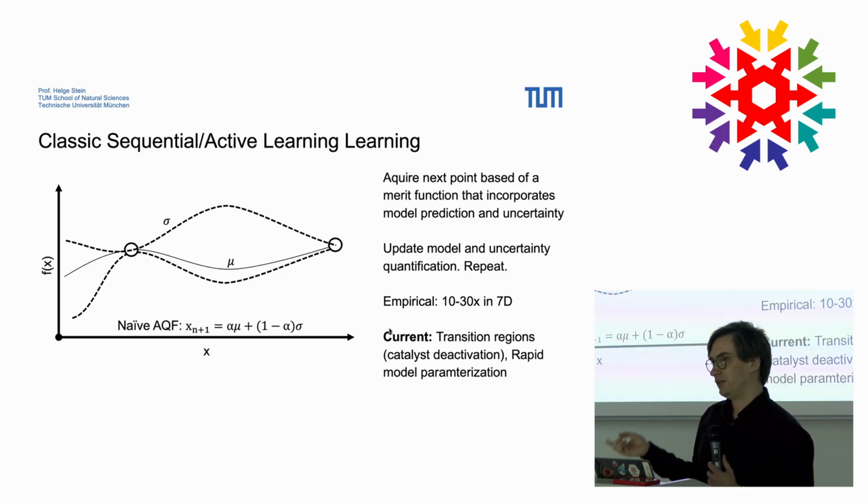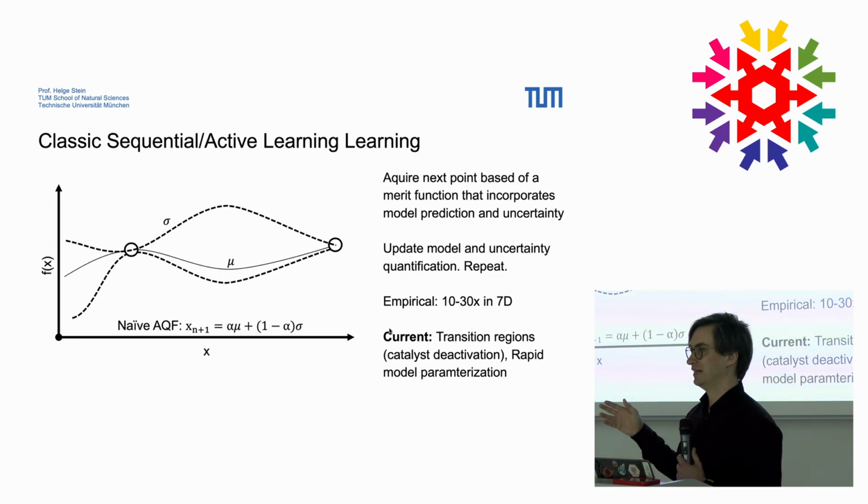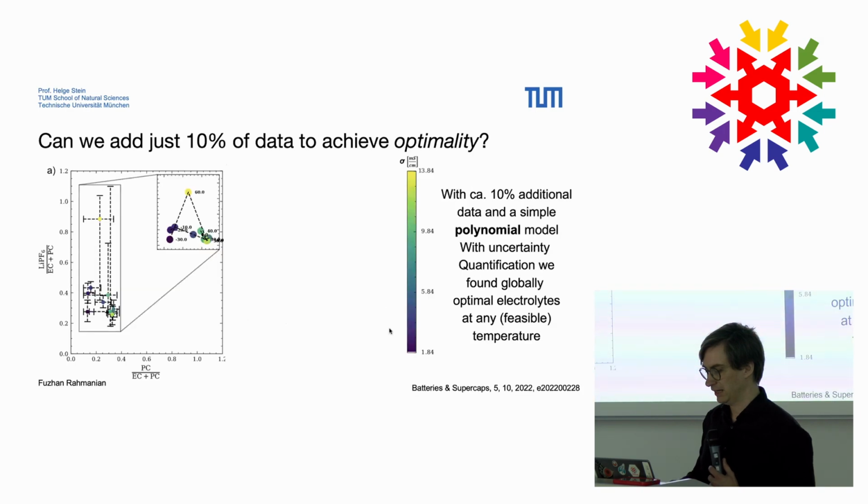This is for the improvement of functional properties. It's much, much harder to reduce the number of experiments necessary to train any kind of model from which you want to learn something, because it turns out random sampling is typically the best. So having active learning or reinforcement learning for good models is a topic of current research.